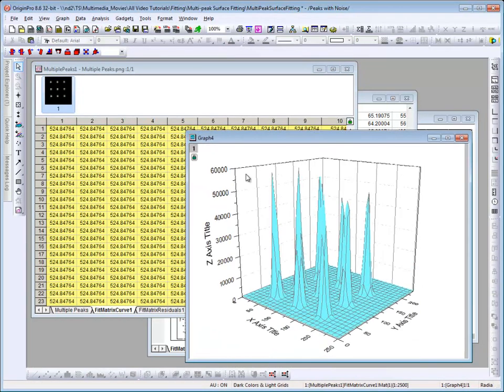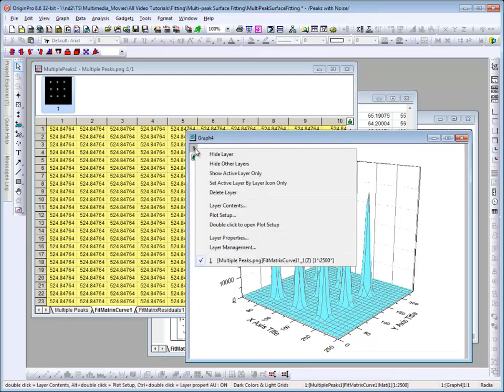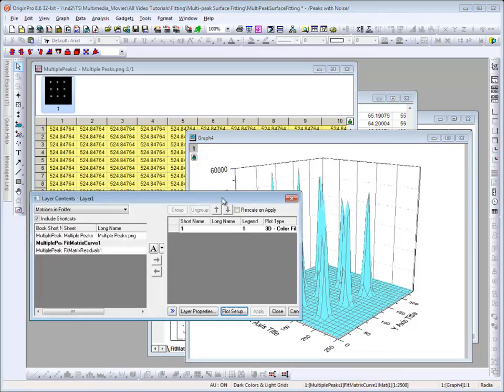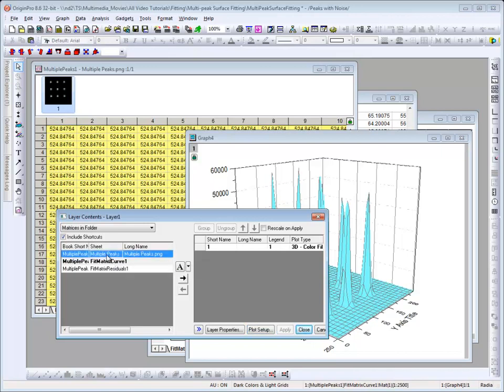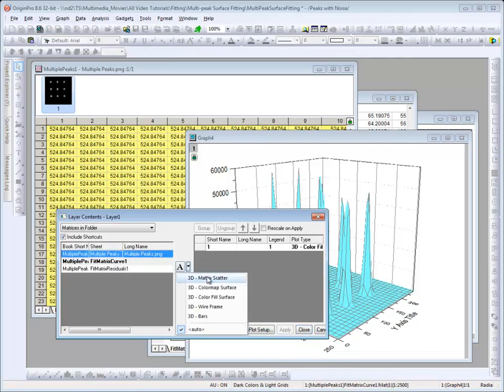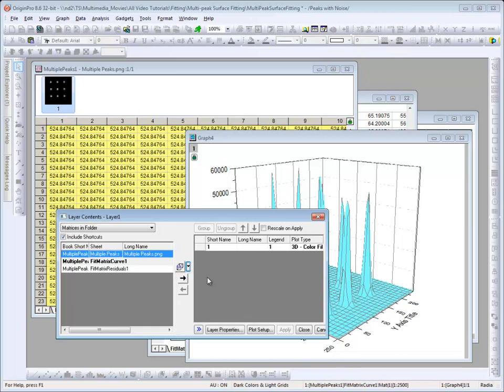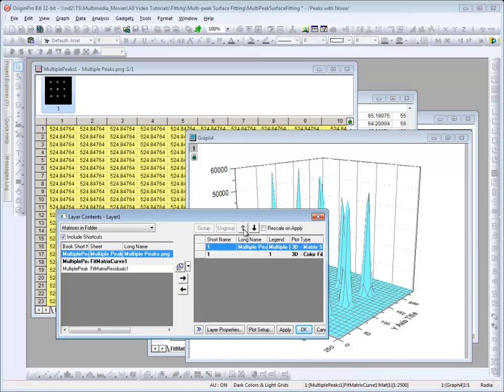Now I'd like to add the original data as scatter points. To do so, I'll right-click on the layer icon and select Layer Contents. With the Layer Contents dialog, I will select the original data and I want to bring it over as a scatter. And I want the scatter data to draw on top of the surface, so I move it to be the top layer, and I select OK.